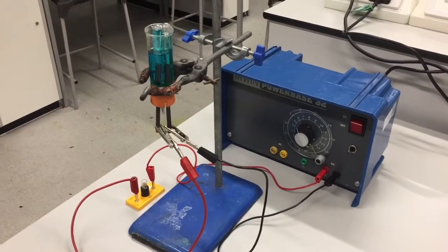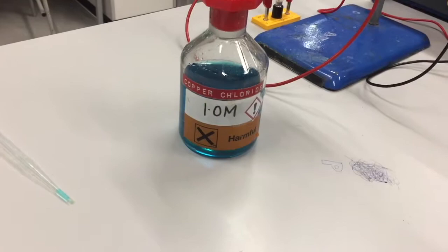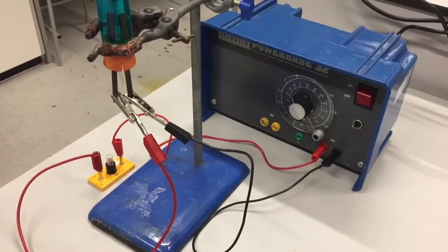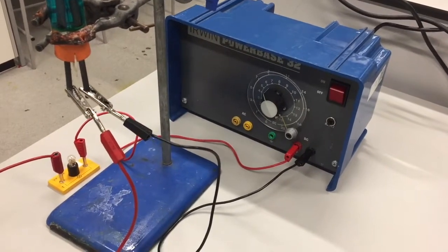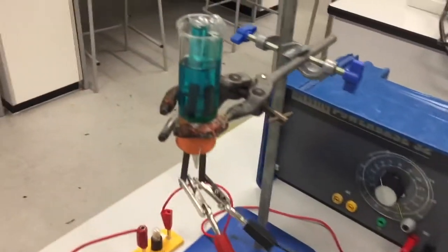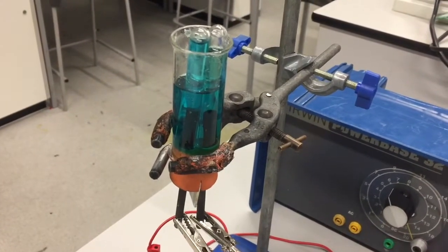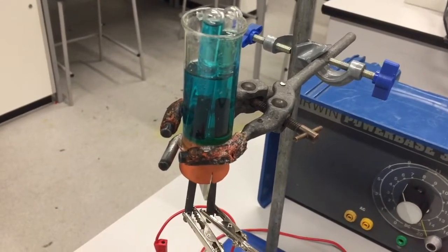So in the first case, we've got the most simple one here. This is copper chloride. And just to take us through the basic circuit, there are different ways to do this, but we've got a power pack on 6 volts. You can use batteries, but I think power packs are much easier. We've got an electrolysis cell. This is a particularly good one, but you can just use beakers with a piece of cardboard to hold the electrodes. Upside down test tubes are fine.